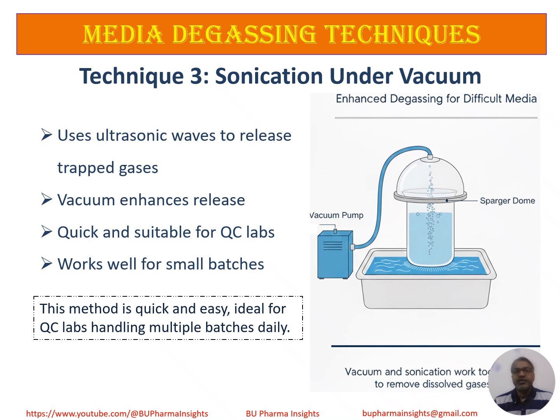Sonication removes dissolved gases by using ultrasonic waves to dislodge trapped microbubbles from the medium. Applying vacuum during sonication further enhances gas removal. However, care must be taken to avoid overheating the medium, and this method is not ideal for large volumes. Key points: fast and easy degassing, well suited for QC labs handling multiple daily batches, and most effective for small volumes. When used properly, sonication offers a practical and efficient degassing option.